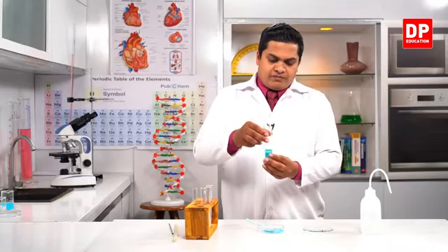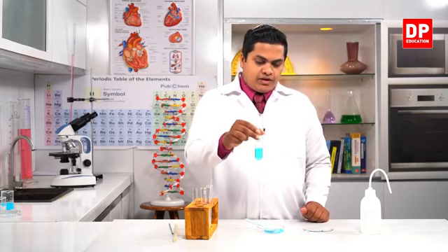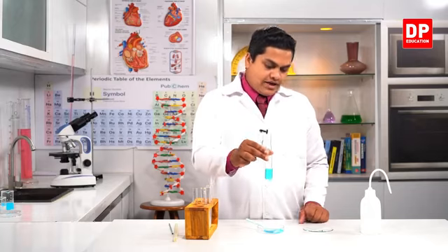Right, so I have prepared my copper sulfate solution here. It has a light blue color. You can see it very clearly. It has a light blue color.